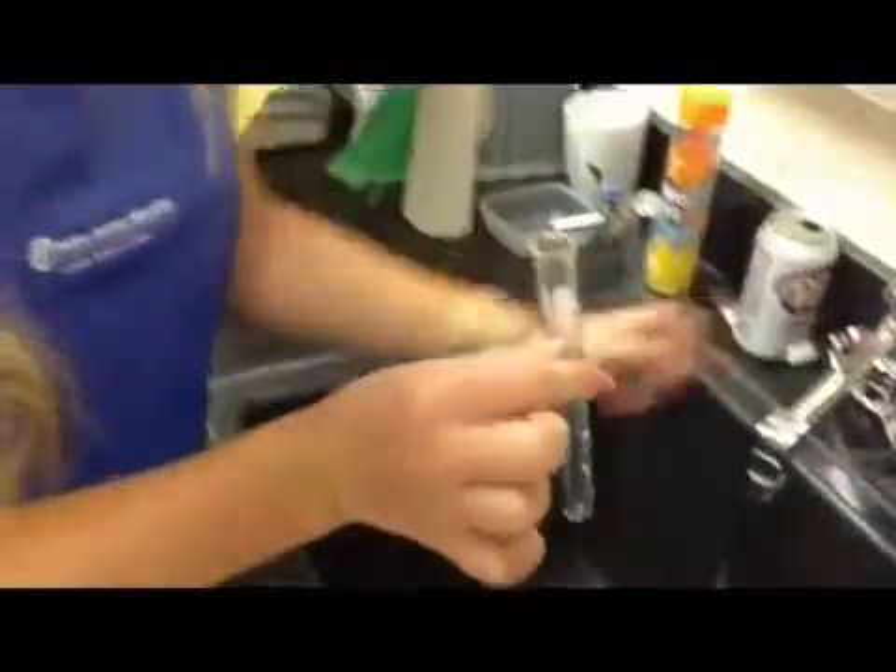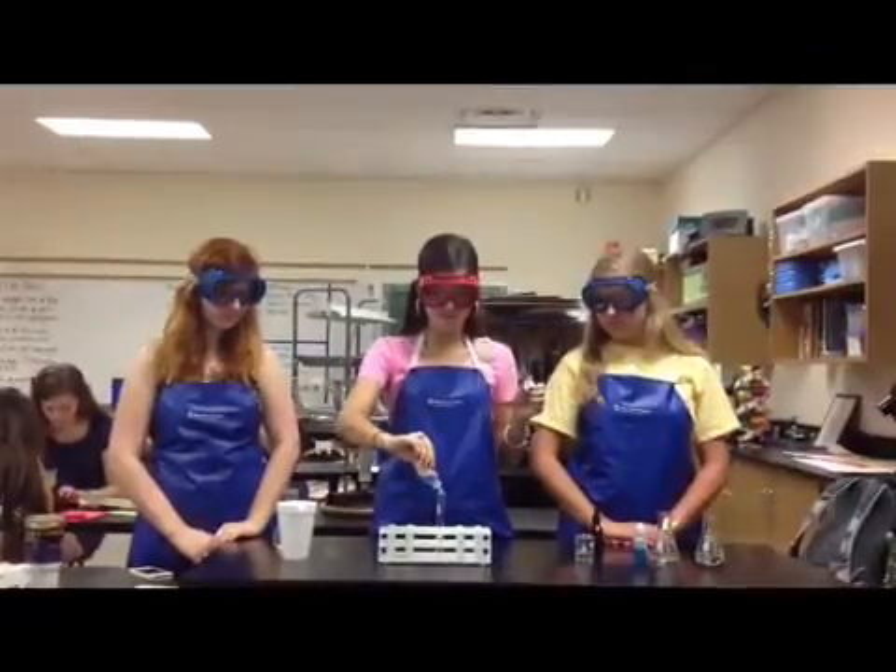Make sure you rinse it out. Now we're going to test our mystery solution for protein using the Biuret reagent. We're going to put five drops in. After two minutes you can tell that there is a negative reaction for protein.